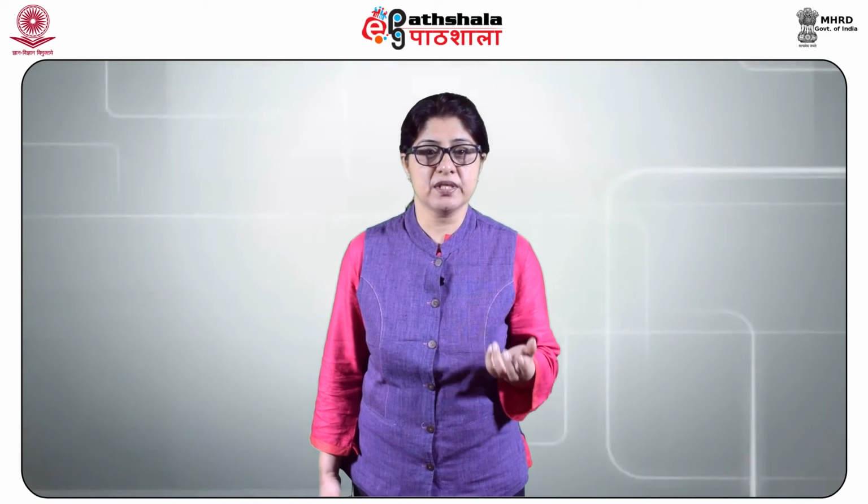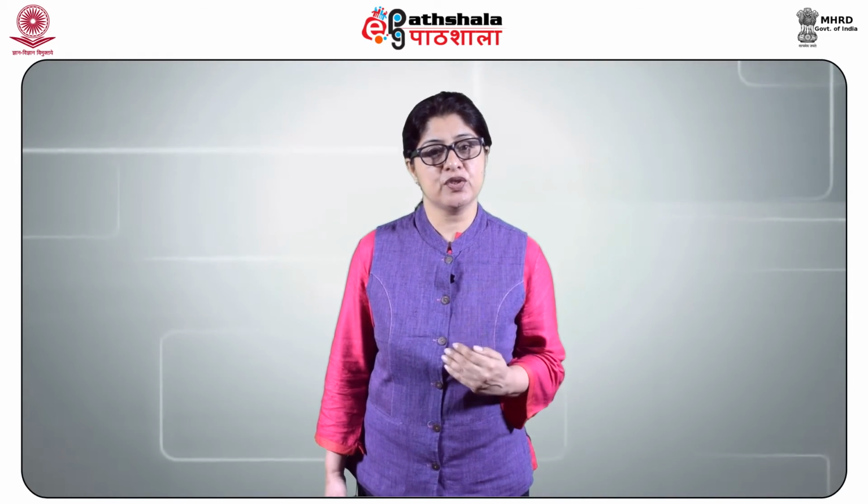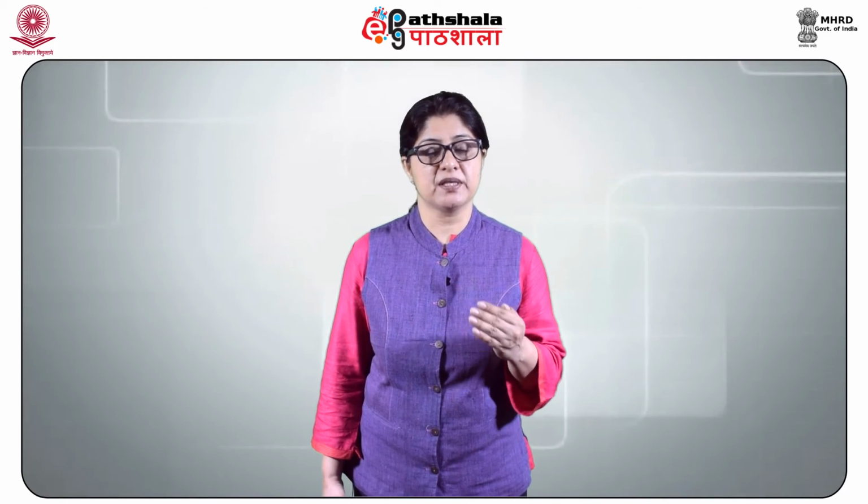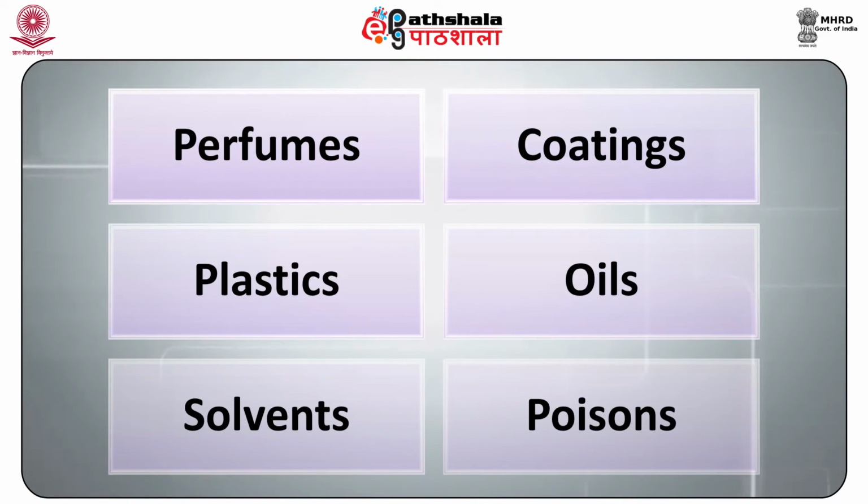None of these materials are single compounds but definite mixtures, and for this reason identification may be established by preparing a chromatogram. In addition to the applications mentioned in this paper, such materials as perfumes, coatings, plastics, oils, solvents and poisons readily lend themselves to chromatographic analysis.